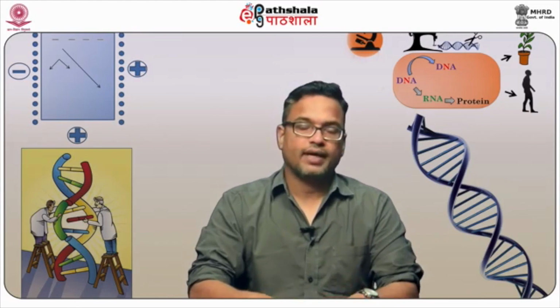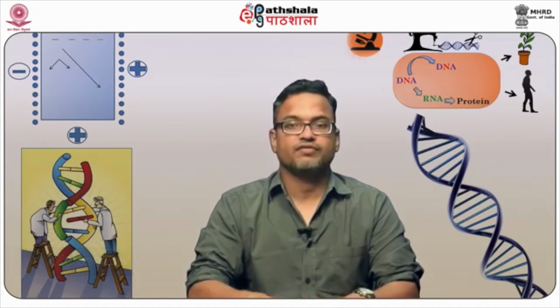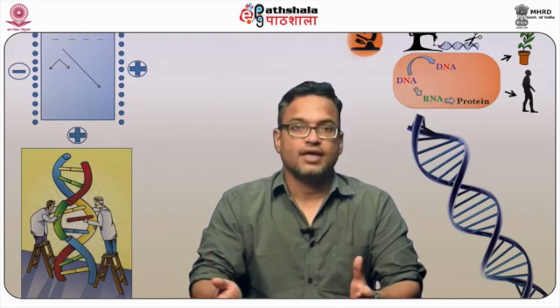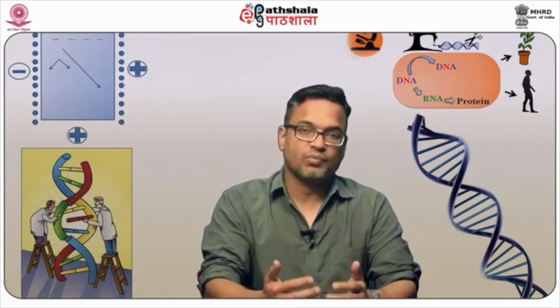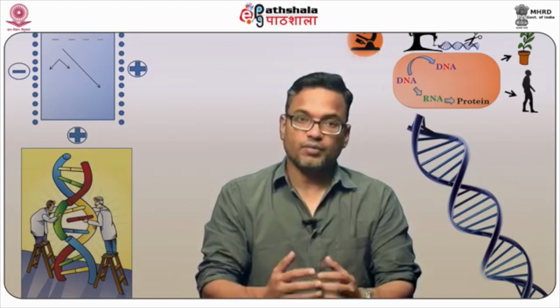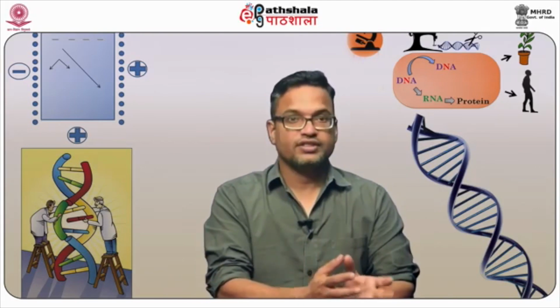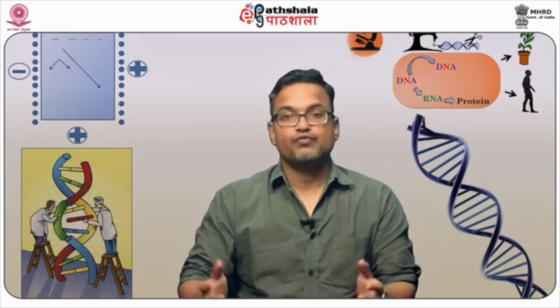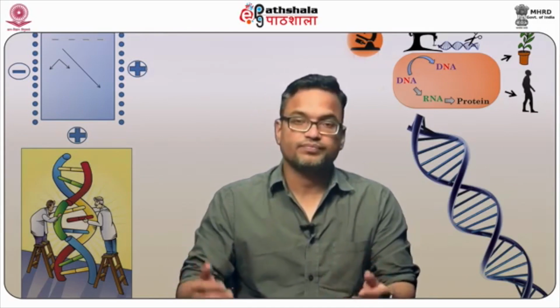So I hope the students have understood by the end of this module that microscopy has become a very integral part of research for biomedical and basic researchers, because of the range of applications it has. It has given researchers the potential to expand and to understand biological complexity by using this microscope tool. Microscopy, as you can see, has also evolved over the years. To begin with, the light sources were just natural light or the mercury lamp, and from there it has evolved up to the two photon system, where we use just a very small amount of light to illuminate our sample to get a better resolution.